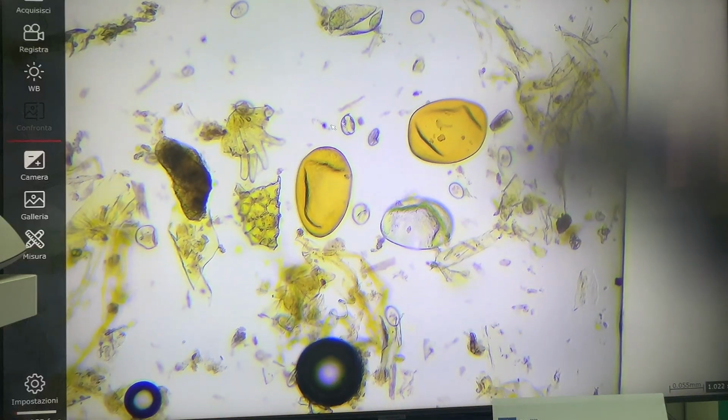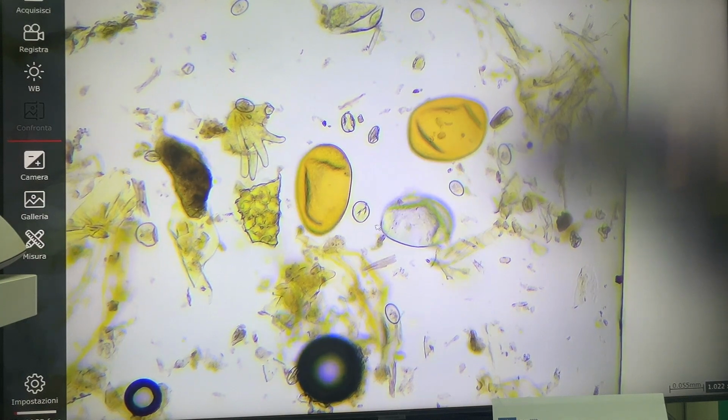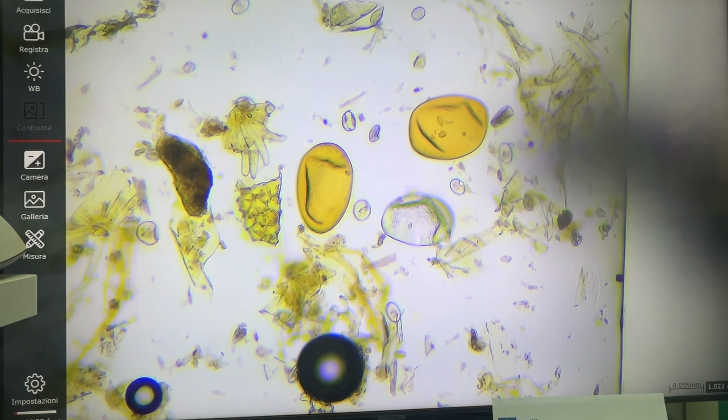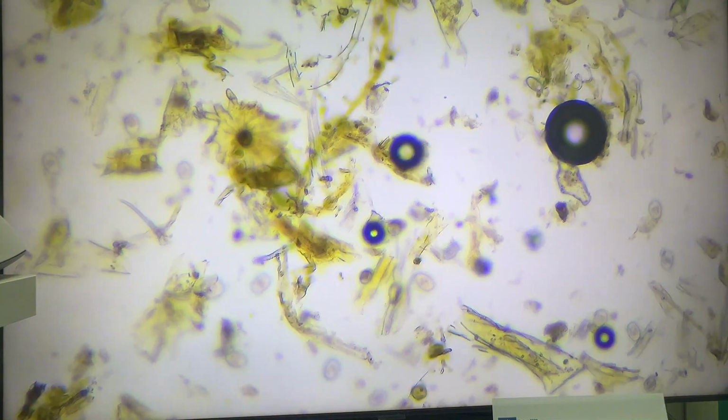We have an image where there are Fasciola and Paramphistomum, both of them, and also some Eimeria oocysts. As we can see here, there are the eggshells of the liver and rumen flukes, so it's different in comparison with other techniques, for example sedimentation or Flukefinder, where we can see the whole egg.